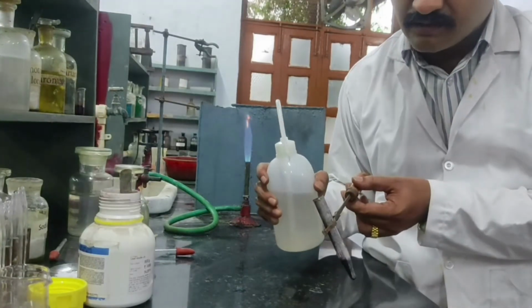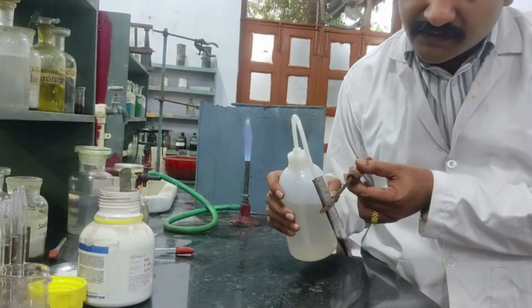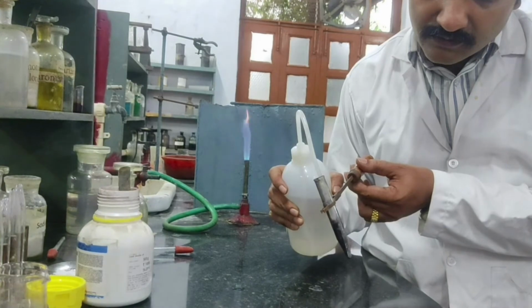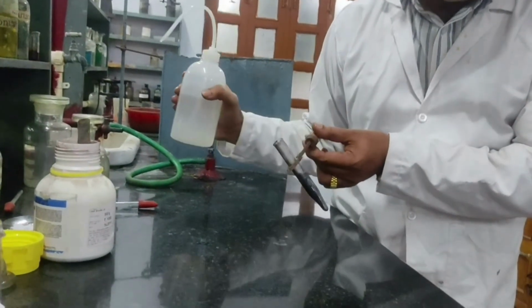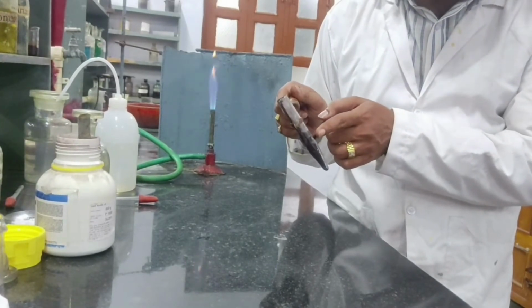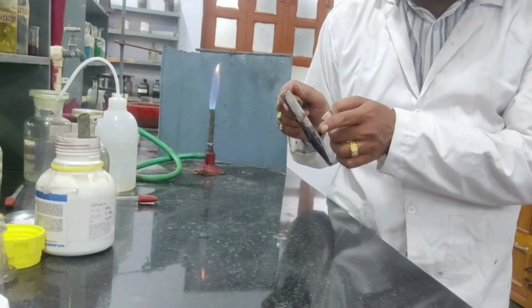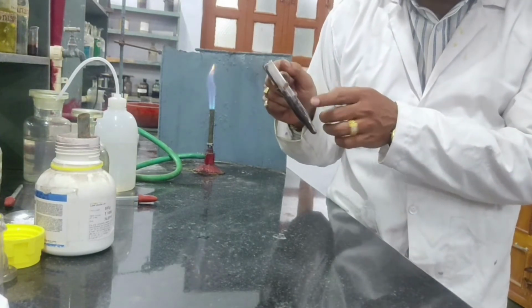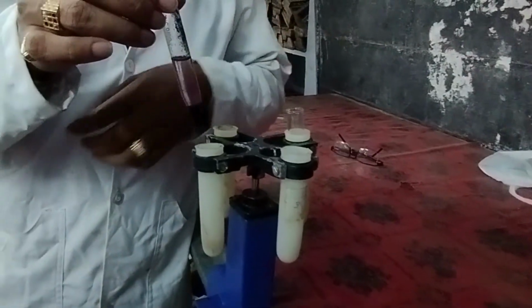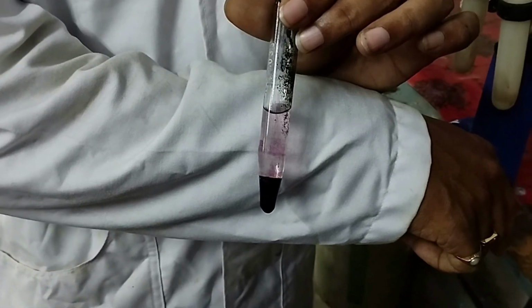Now add a little amount of distilled water to this. Okay. Now you observe the color of the supernatant liquid. If the color is pale pink in color, then Mn+2 is confirmed. So for that, let us centrifuge this and see the color of the supernatant liquid. Okay. Now you observe the color of the supernatant liquid. This color, light pale pink in color, is confirming the presence of Mn+2.